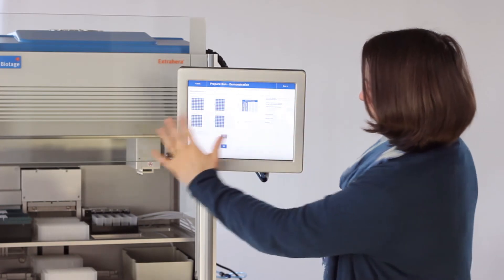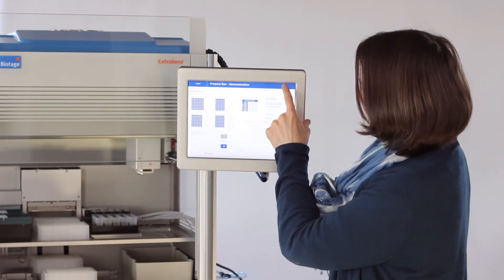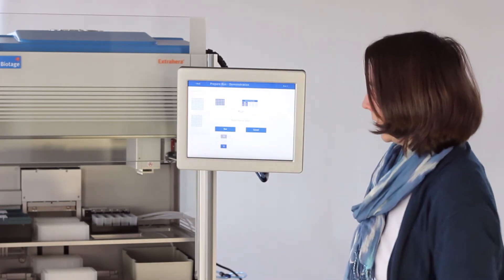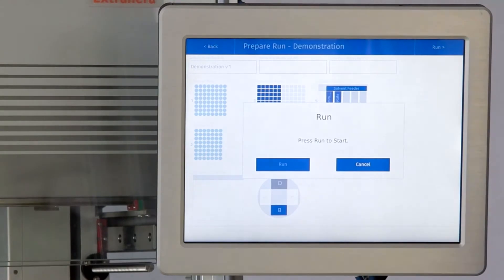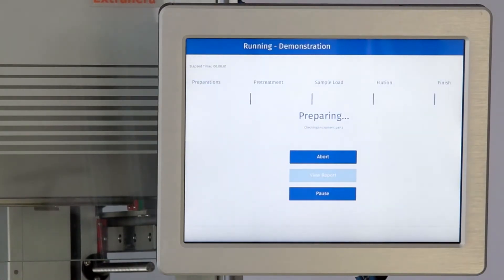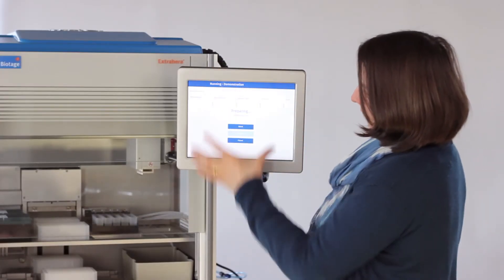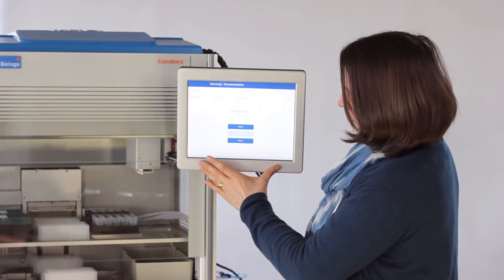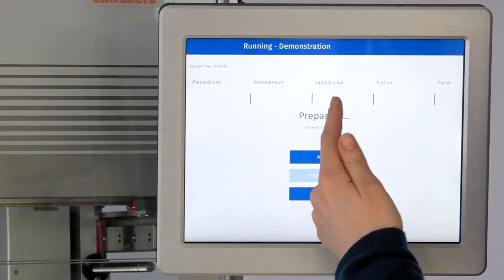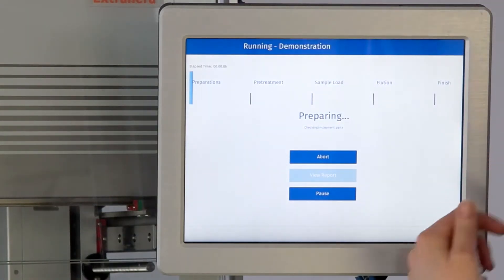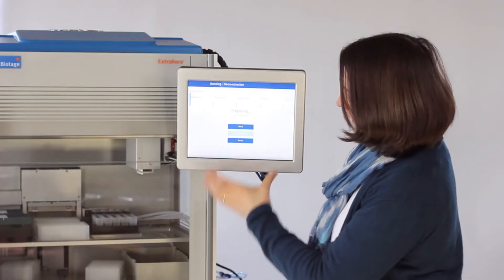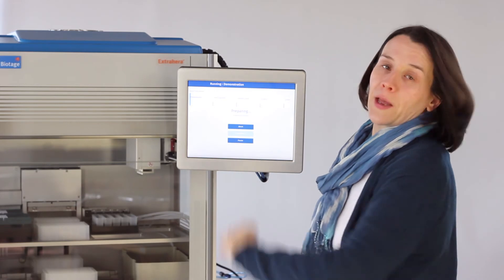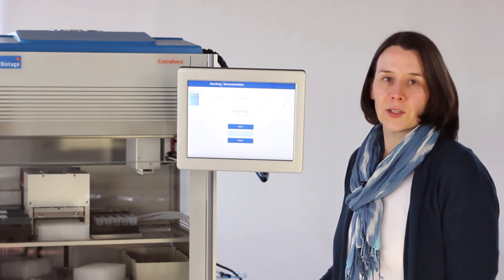Then everything is ready to go and we just push run and the method will start. It brings up the screen and it shows you which parts of the method it's in and where it's got to in the method, so you can watch progress as it goes through.